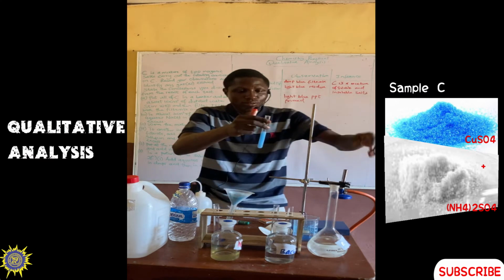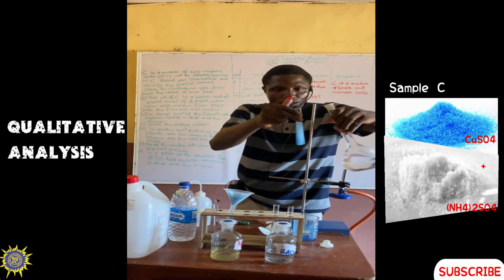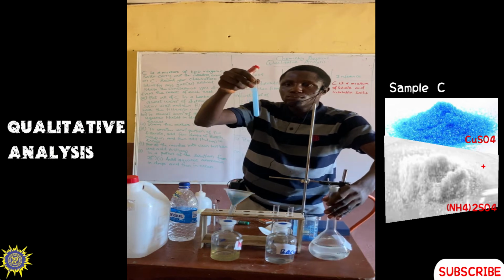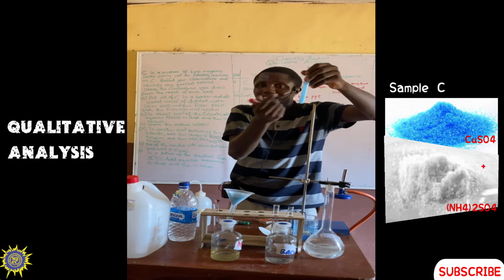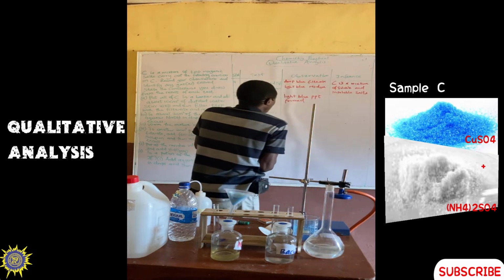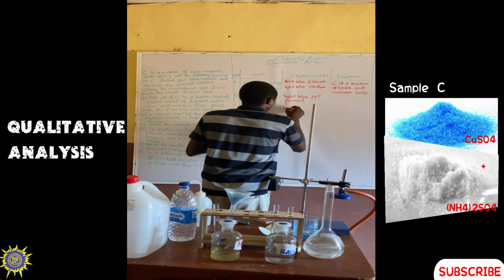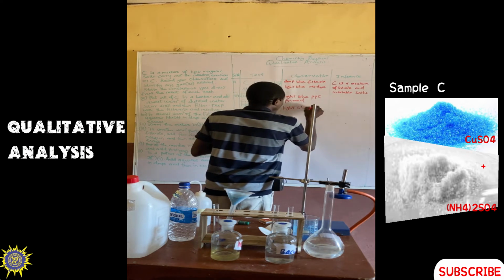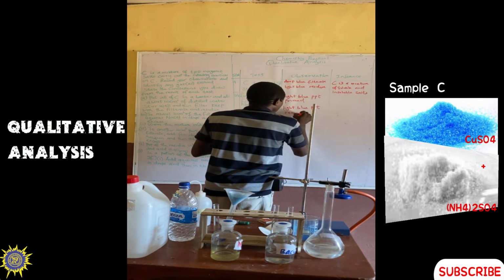When you have more of it, the light blue precipitate persists, that is, it remains. The light blue precipitate remains insoluble.